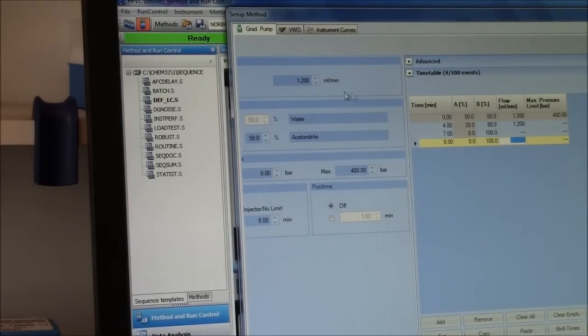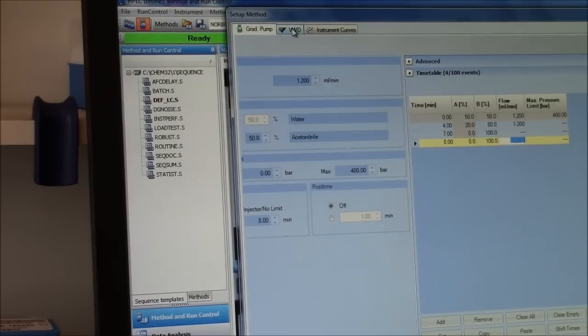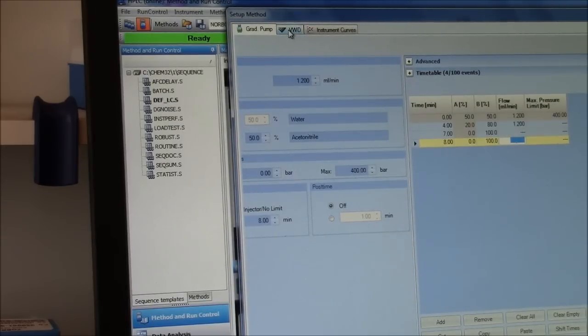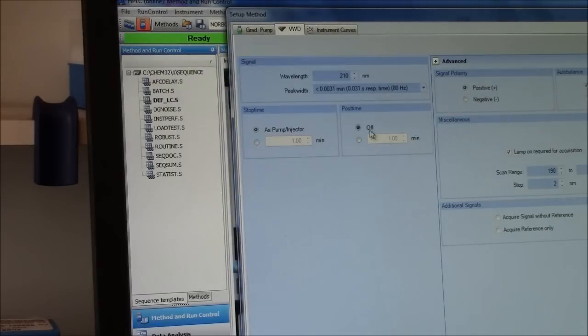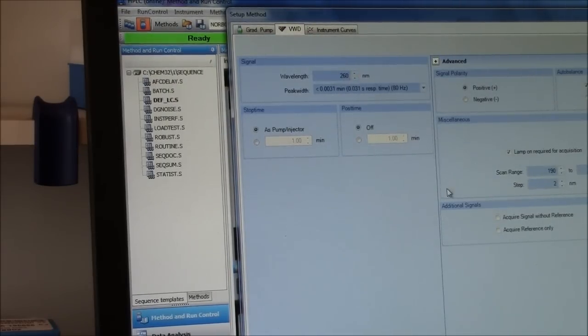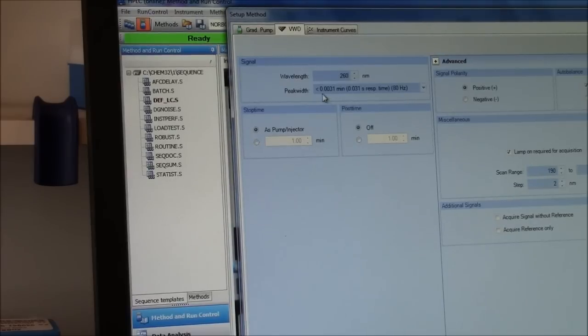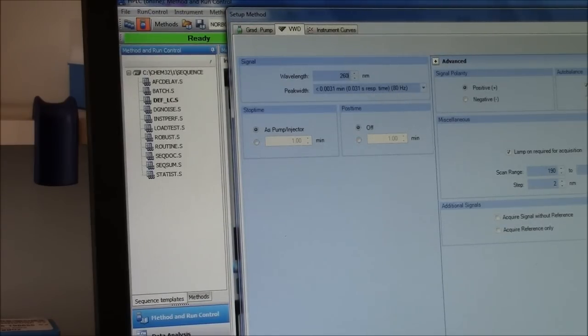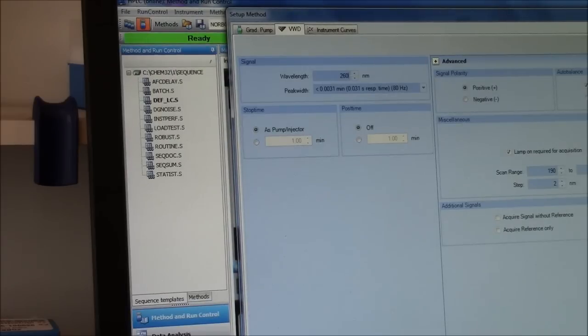Now, before I leave this, I will go to the next tab up here, which is VWD, Variable Wavelength Detector. I want to set my wavelength at 260 nanometers. The time interval is the fastest it can read, 80 hertz. That is 80 samples per second.